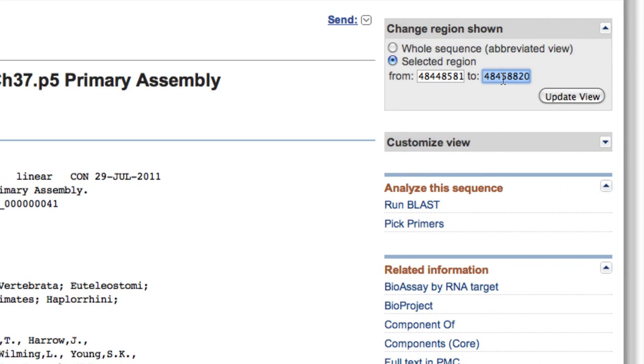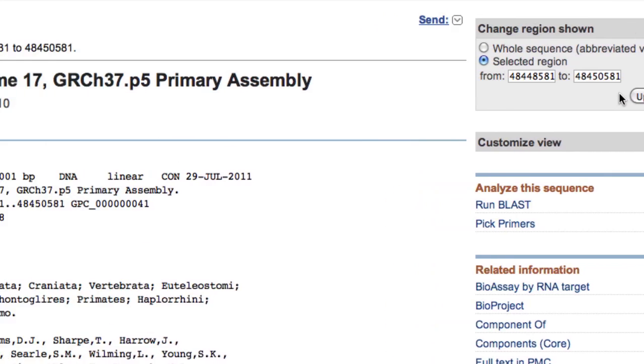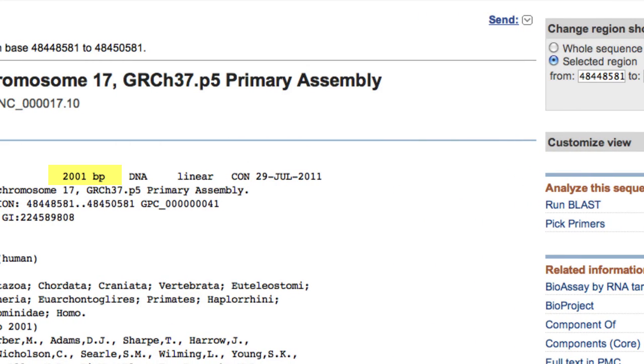If you want only the upstream 2 kilobases, also change the to coordinate to the original from coordinate value, minus 1 if you want exactly 2,000 bases.